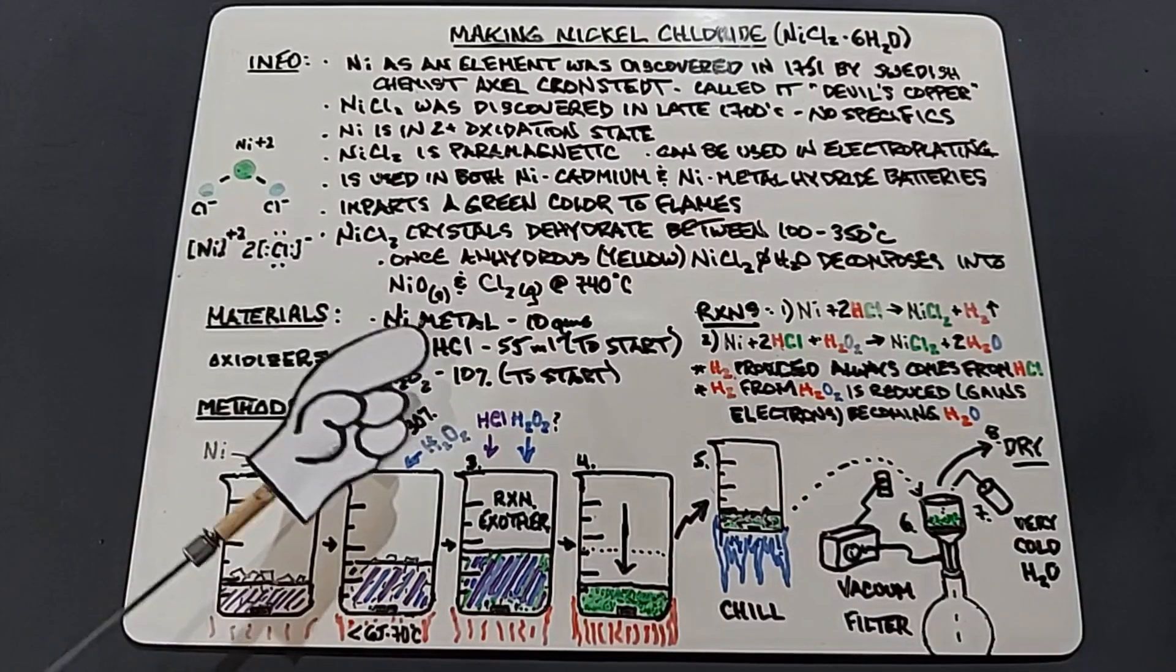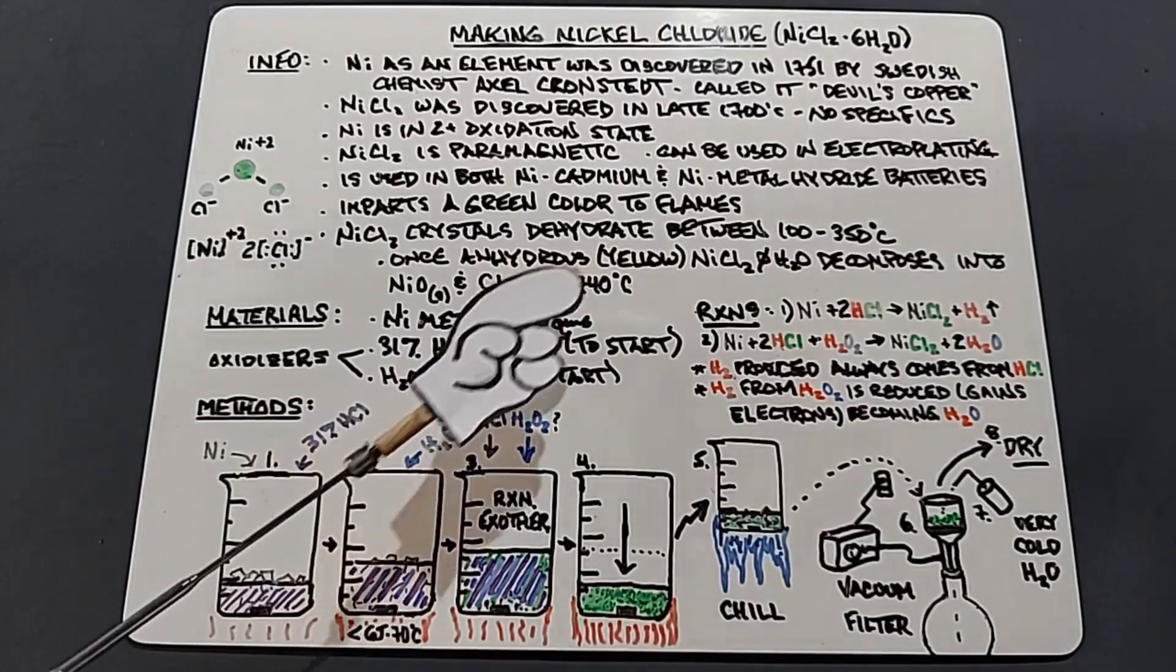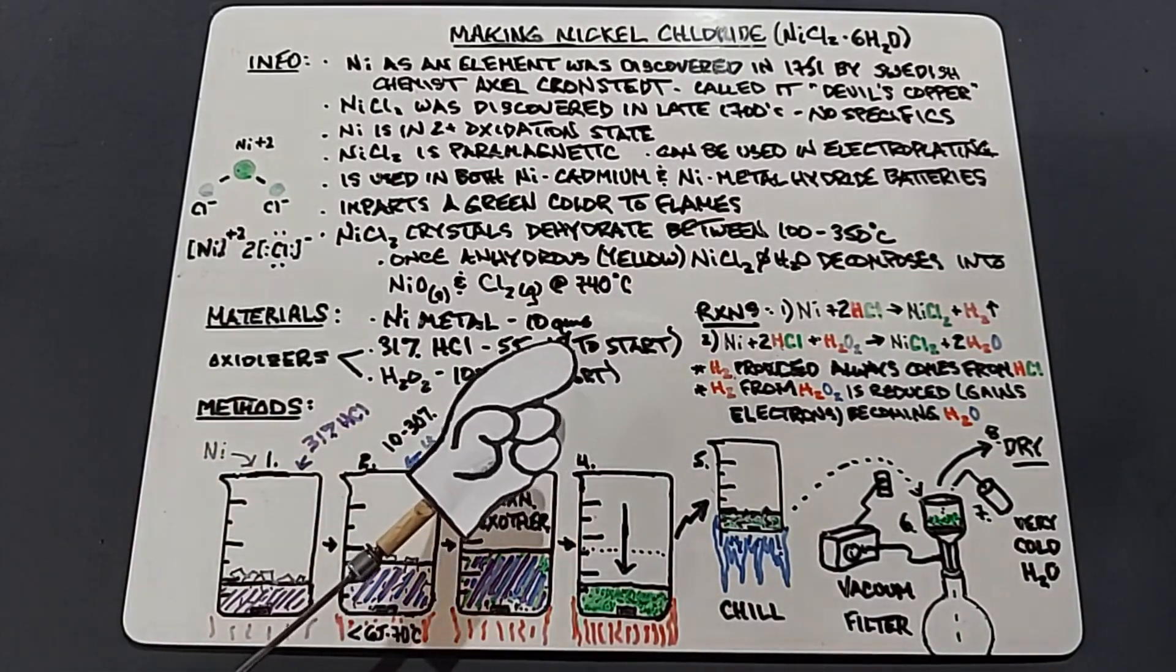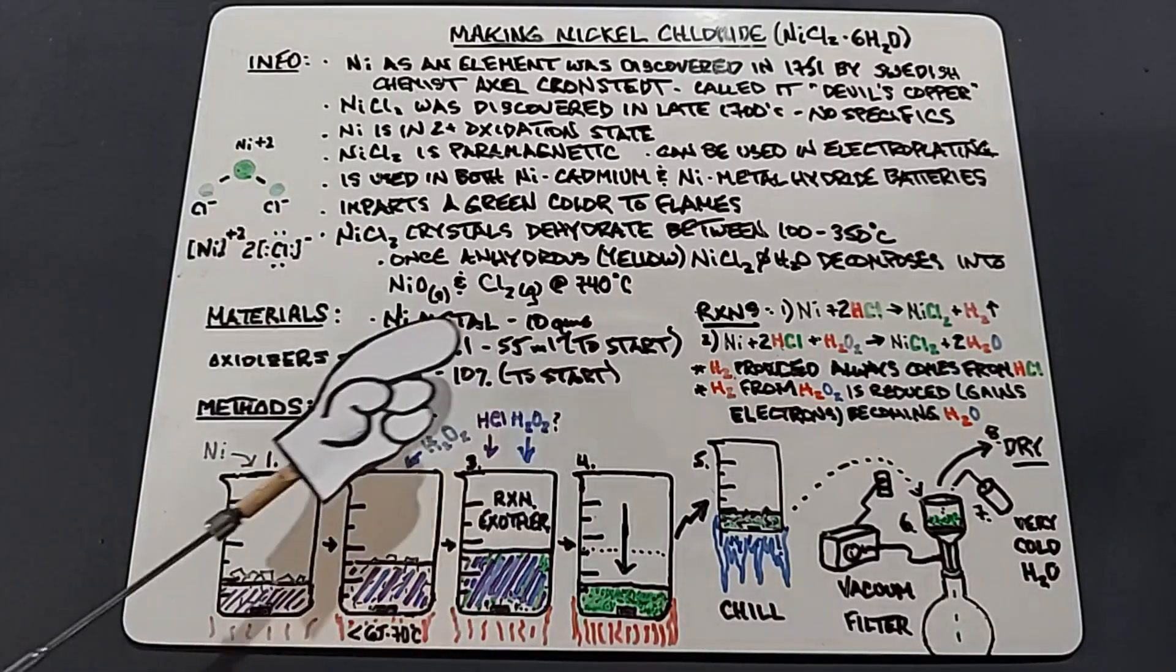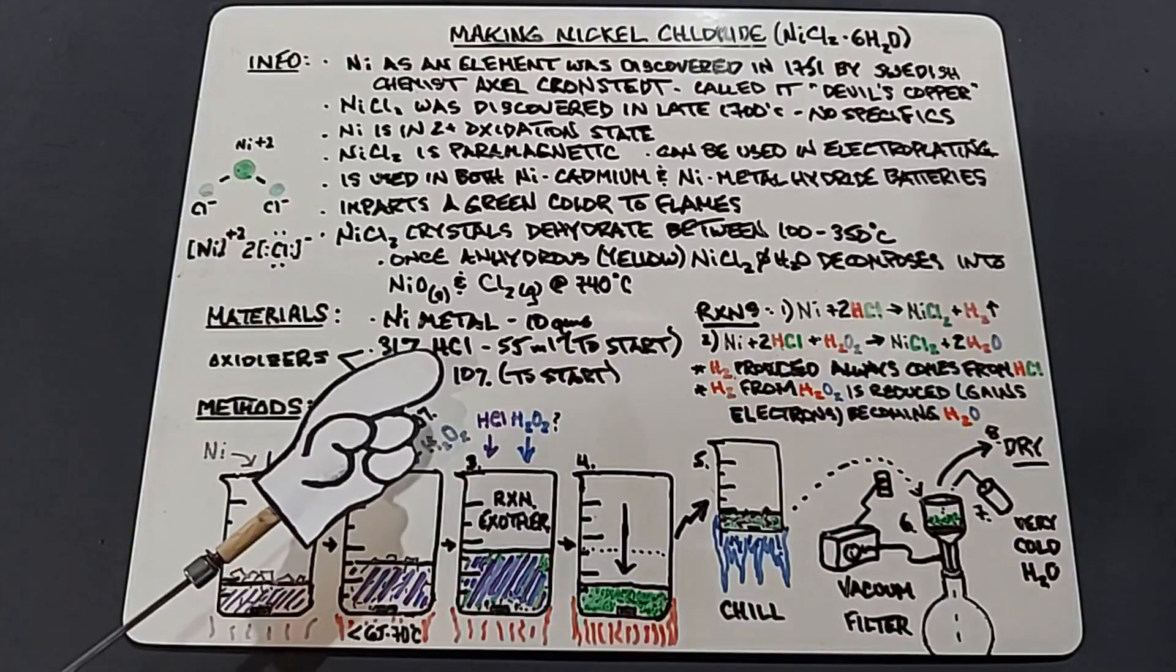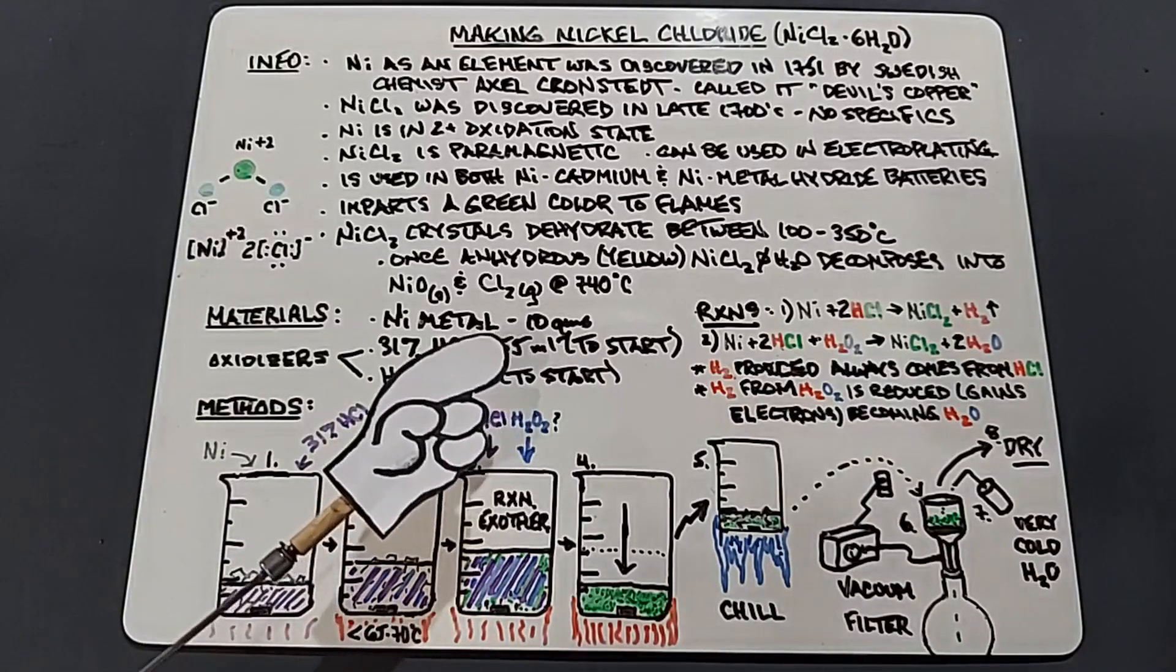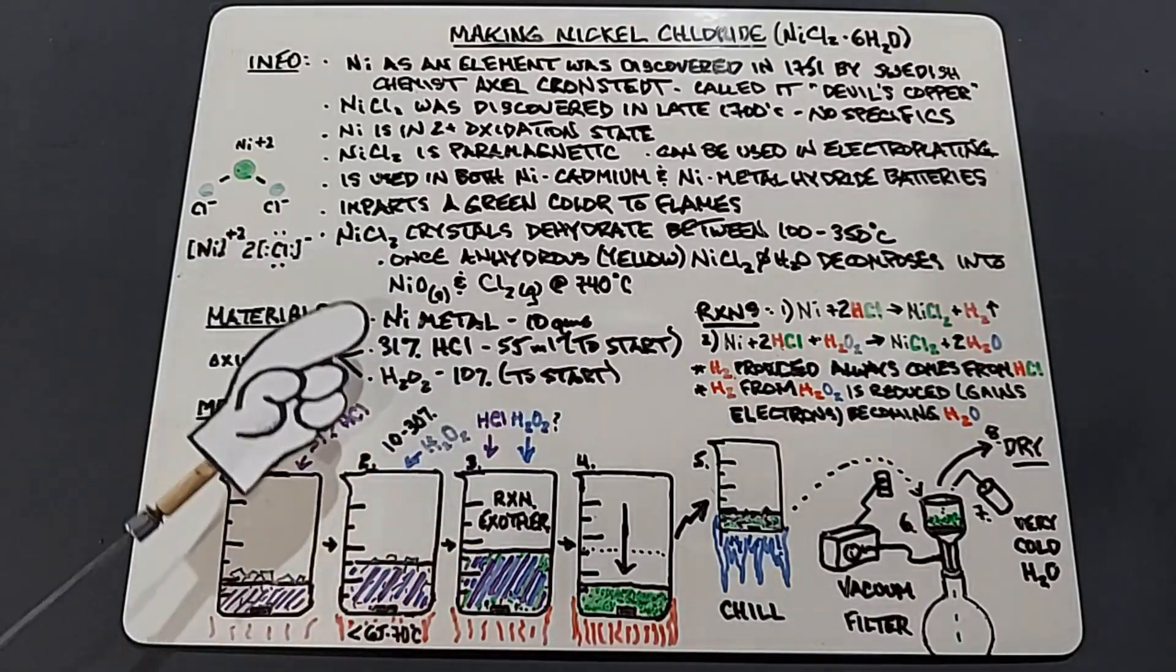We also need 31% hydrochloric acid, 55 milliliters to start, and that of course is always to start because often you need to add more. And hydrogen peroxide 10%, also to start, meaning I'll probably go up in percentage if 10% doesn't seem to be doing the trick. Nickel is hard to break down. These, of course, are the two oxidizers that we'll be using to break down the nickel and make the nickel chloride.